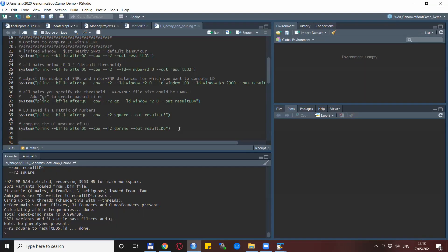We also talked about other measures of LD besides R², for example D prime. This is also possible to compute with Plink with ease. You just need to specify the --r2 dprime option and you get the LD values in that metric.